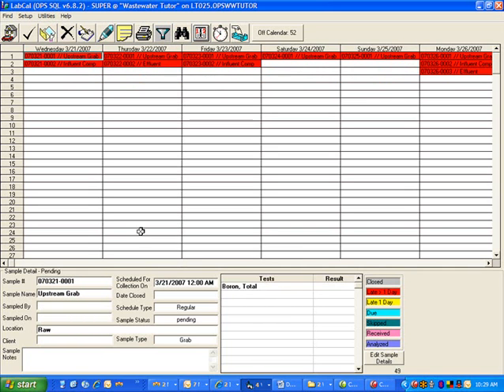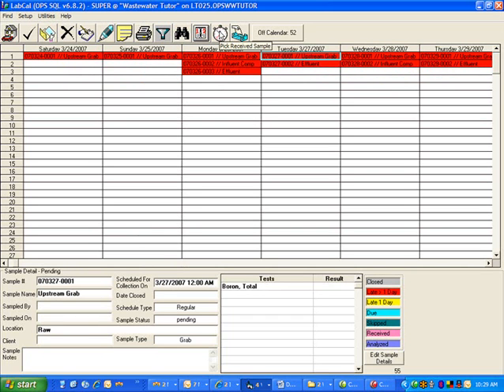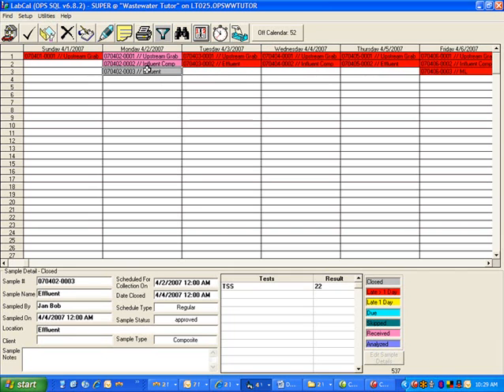Now, there's also ways to run reports, or quickly pick from samples, like I want to pick from overdue samples, or I want to pick from my received samples. This would be the case where maybe I received a sample 60 days ago, sent my metals off to some commercial lab, and then they're going to come back and give me the results. Now I can't close that out until they're done with it. So these things here give us a quick way to select from them.